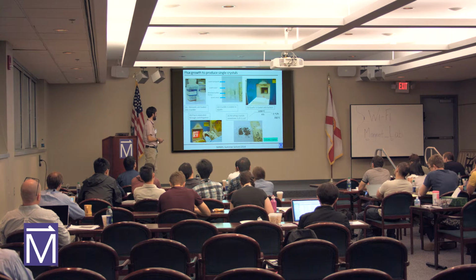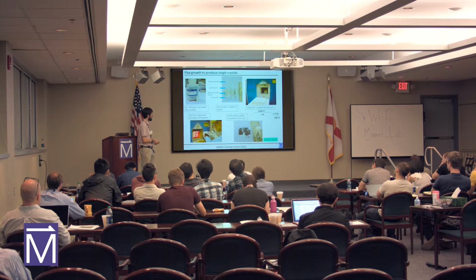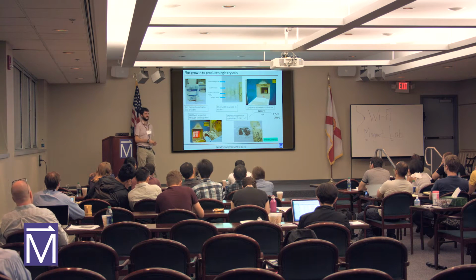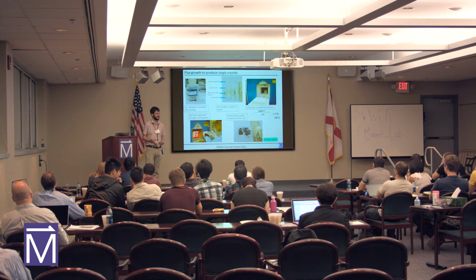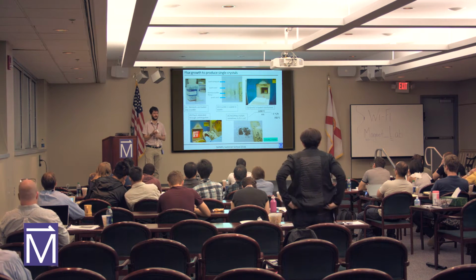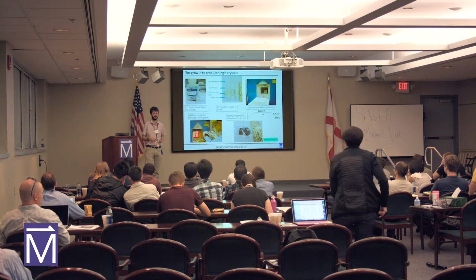And if you've done what the crystal likes, and it's different for every material, you can form very large, sometimes very large, single crystal specimens. And these are, in a way, as big as they get, okay? So do you have any questions about this technique? Because it's easily implemented pretty much anywhere, and it's a very useful tool for making big crystals.